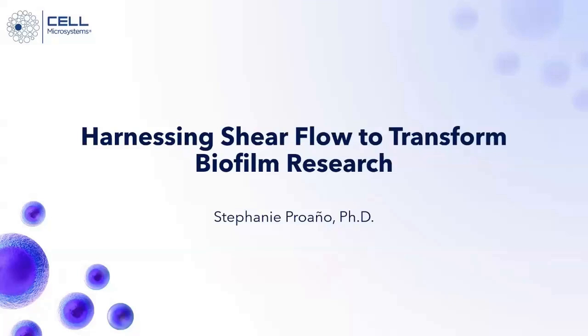Okay. Is it possible to obtain reliable biofilm thickness measurements directly? So that will depend on the imaging system that's paired with the Bioflux. If a confocal, for example, is used, it is certainly possible to obtain these measurements.